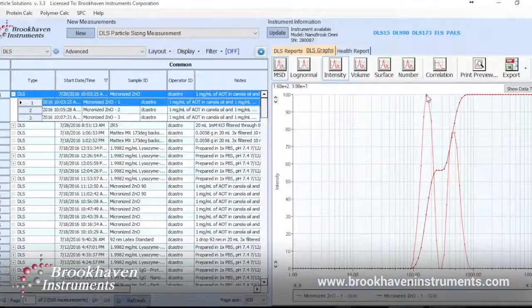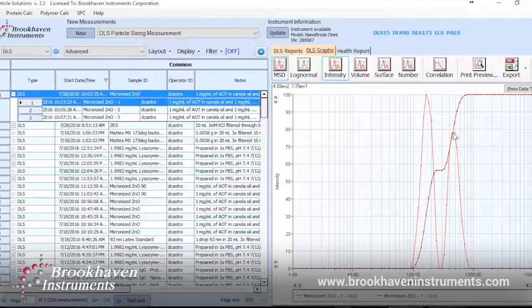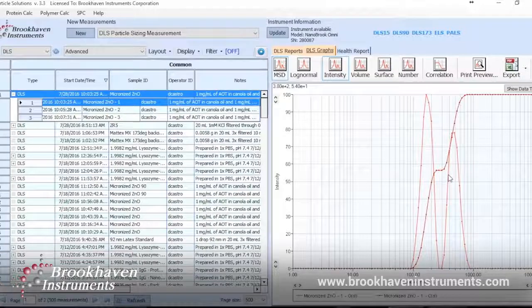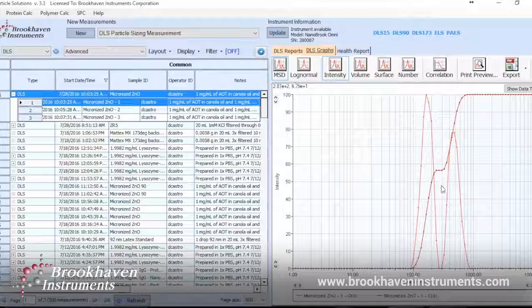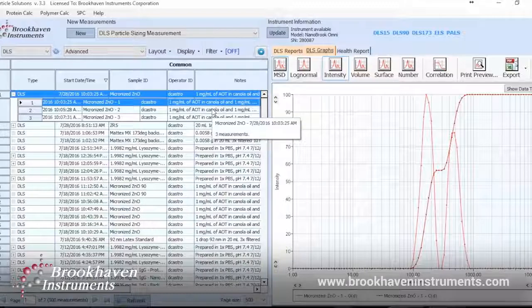If we go back to the multimodal distribution and look at an individual measurement, this data shows us two distinct peaks: one around 150 nanometers and one around 500 nanometers, as seen in the top left corner when the cursor is placed at either peak. These are clearly resolved and give a lot of information about the sample. The expected size is right around 150 nanometers, but the 500 nanometer peak is unexpected. This could mean that the sample is dirty and has a significant amount of dust being detected, or that aggregation is occurring within the sample. In either case, this gives enough information to guide quality control on how to approach corrections, such as filtering the sample or dispersing better.